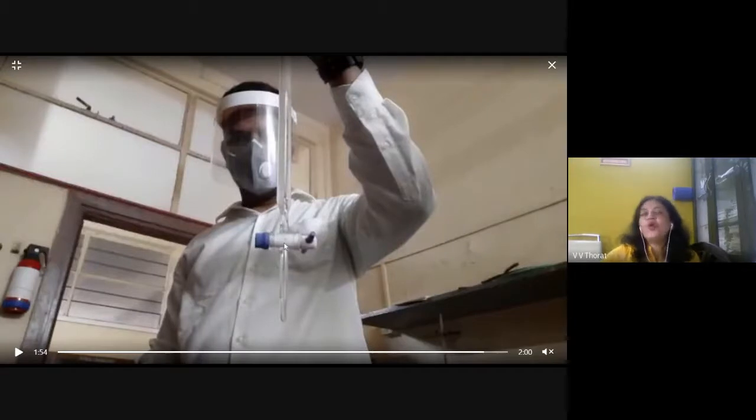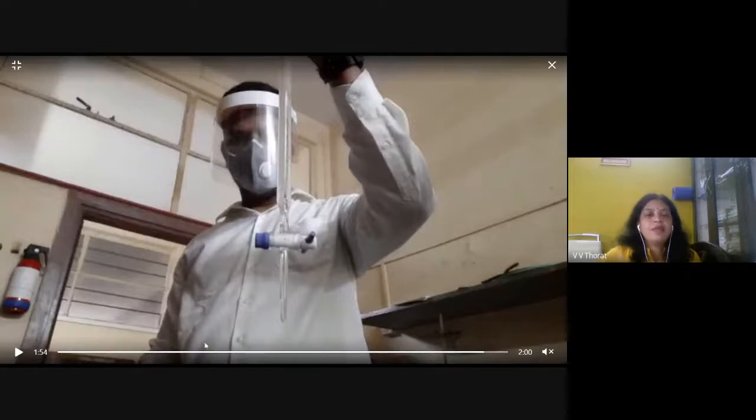There should be no air gap in the nozzle. If you follow instruction, I assure your reading will be same as the expert reading. Okay, so shall I proceed? So now sir has filled the burette. He is fixing the burette on the clamp. Now I stop the sharing.